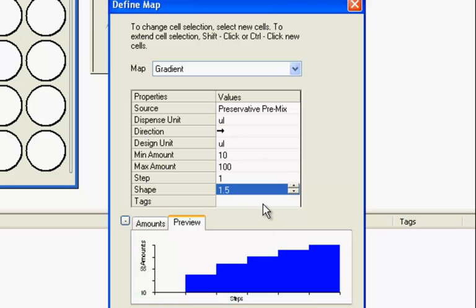And you can see here the last option in this window is the tag, and the tag is the information that is shared with the Automation Studio as to what is to be done with this particular map. For example, whether this is a map for dispensing liquid. So once you say it's a processing or some tag, that would be read by the Automation Studio, and it will know that it has to dispense this particular chemical from the chemical source position defined there into this particular library.